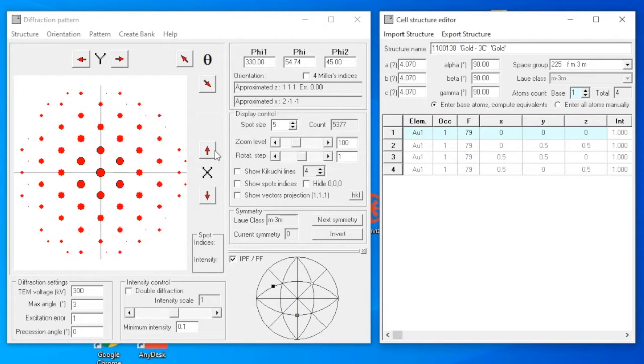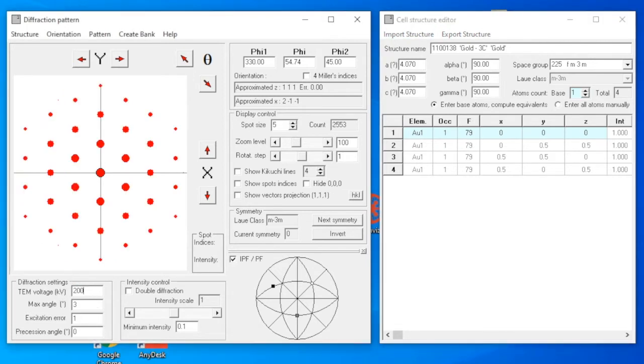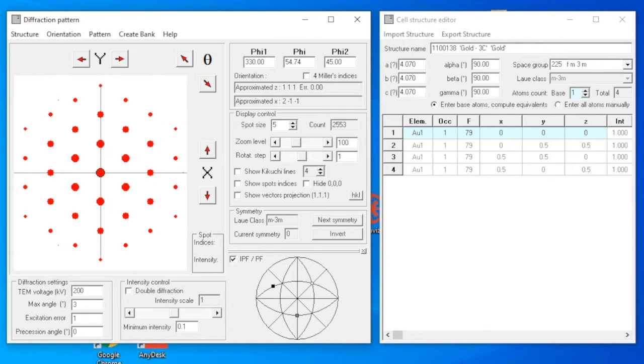Have a very quick look. The space group and the lattice parameters seem reasonable. Moving to the diffraction pattern window on the left, now input the instrument parameters. We use a technite TF20, so the TEM voltage will be 200 keV. We usually leave the maximum angle excitation error the same.